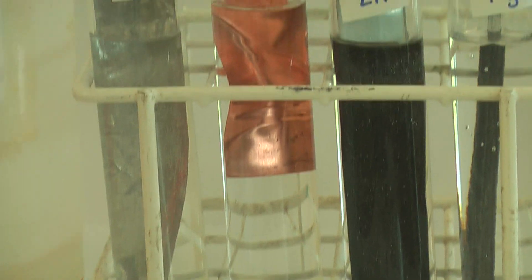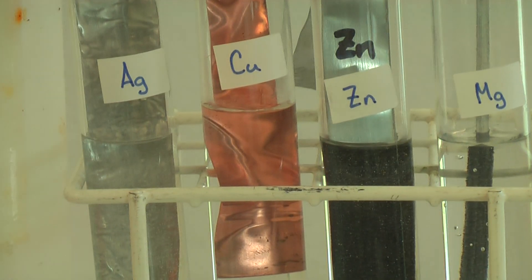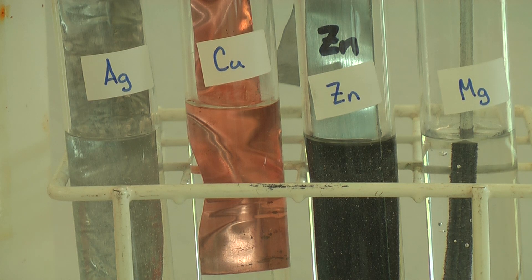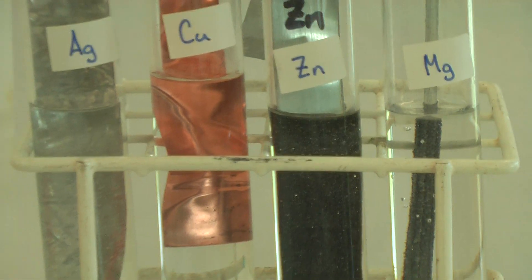What this is showing is that with regards to reactivity with lead nitrate, silver and copper are unreactive, while zinc and magnesium are reactive. You can actually start seeing it glisten now as the reaction proceeds.